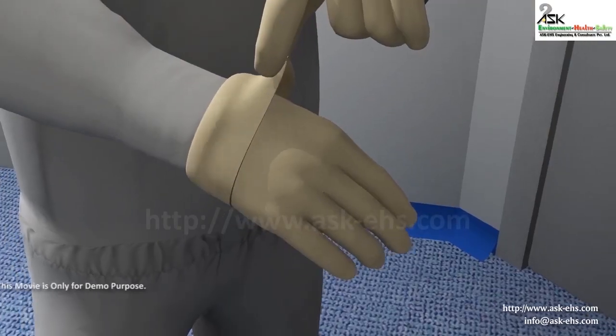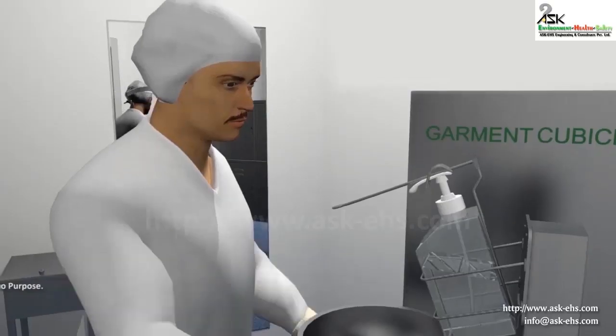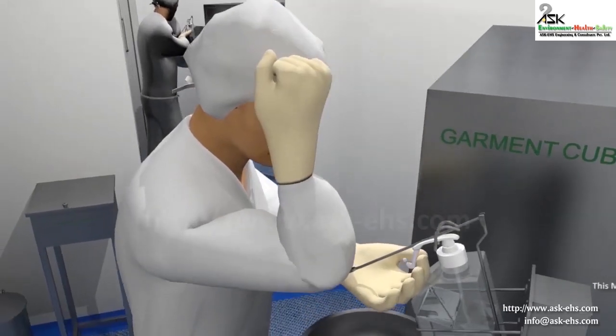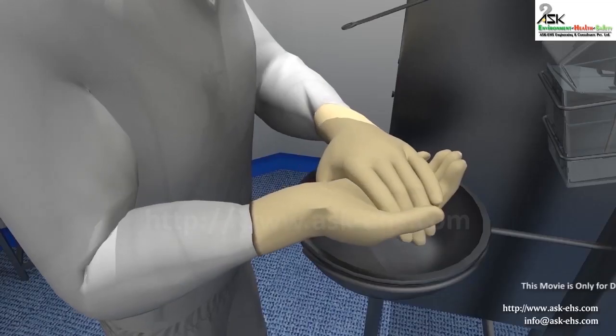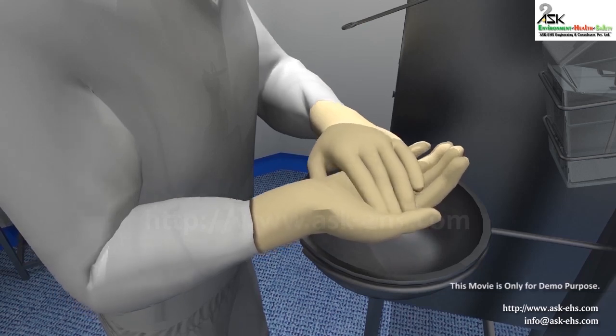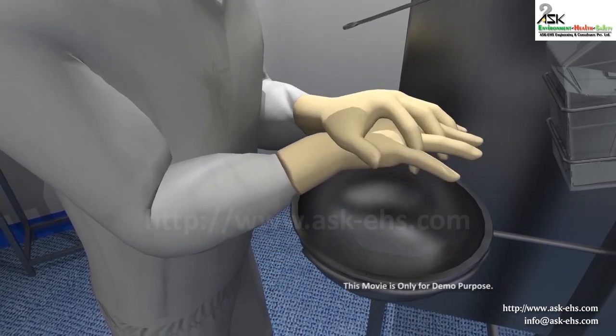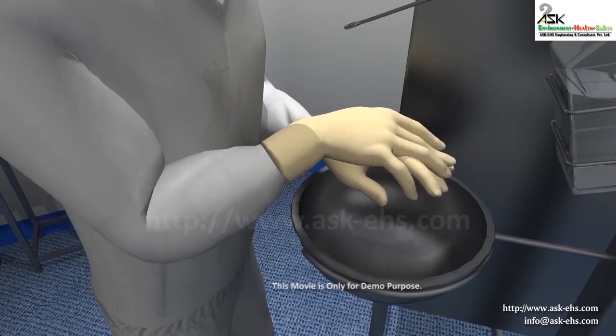Take and wear sterile hand gloves from the glove box. Sanitize your hands by following these steps: first is palm to palm rubbing, then put the palm of right hand over back of left hand and left over back of right hand.